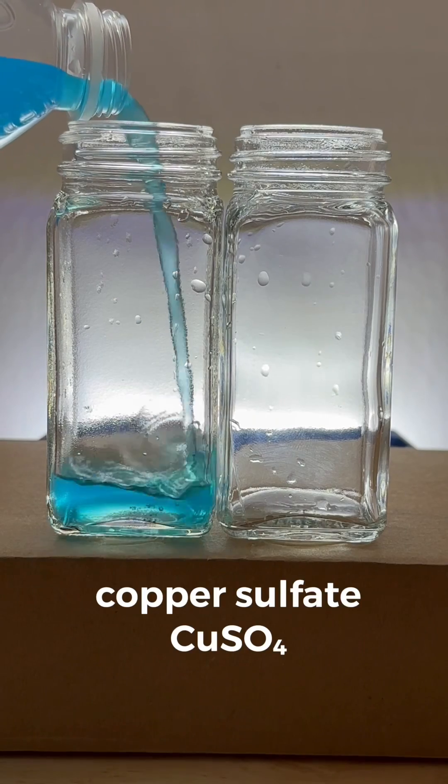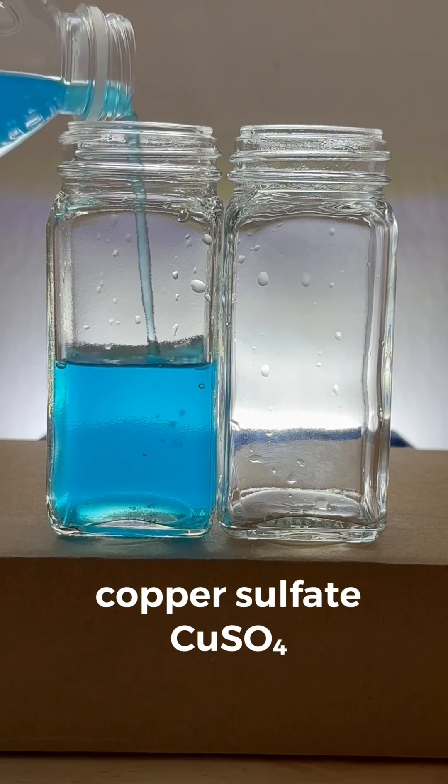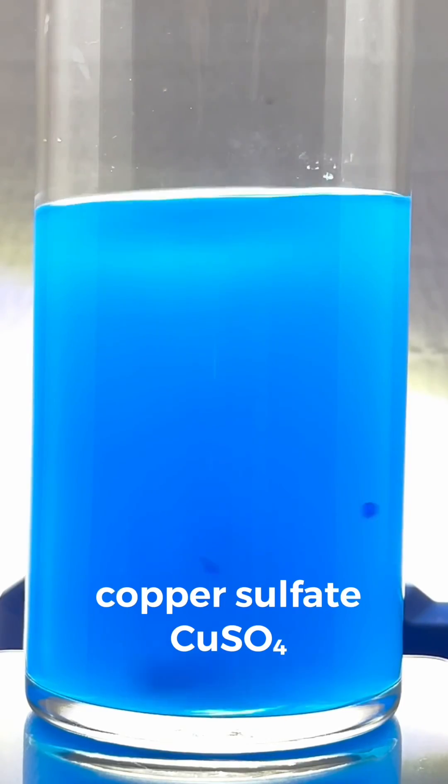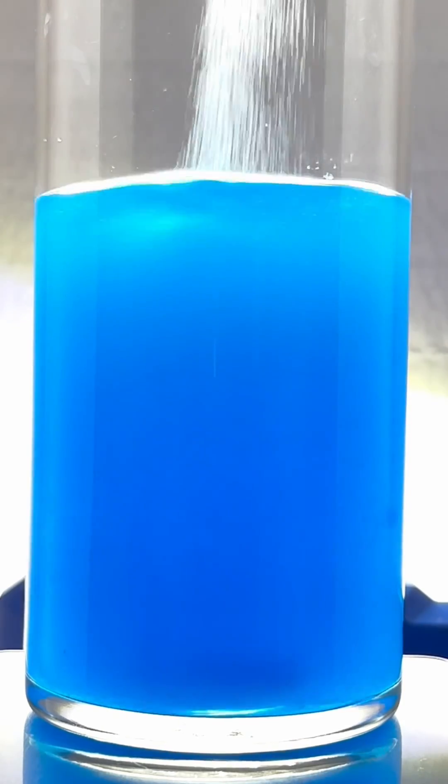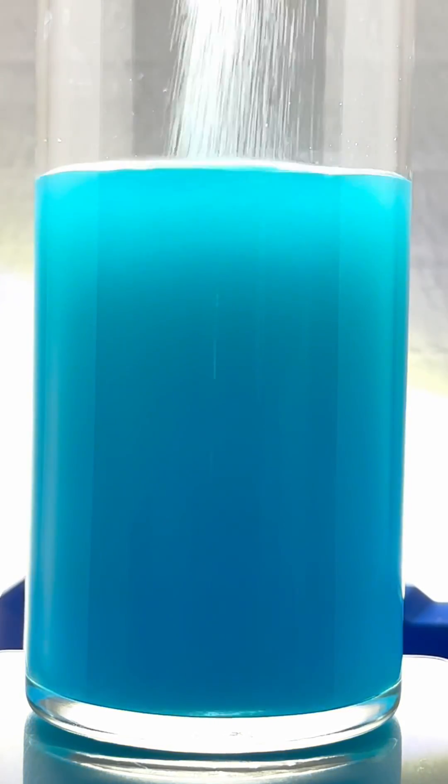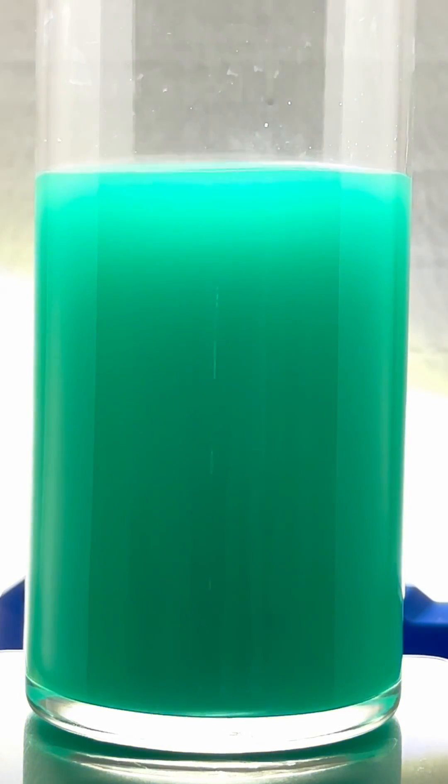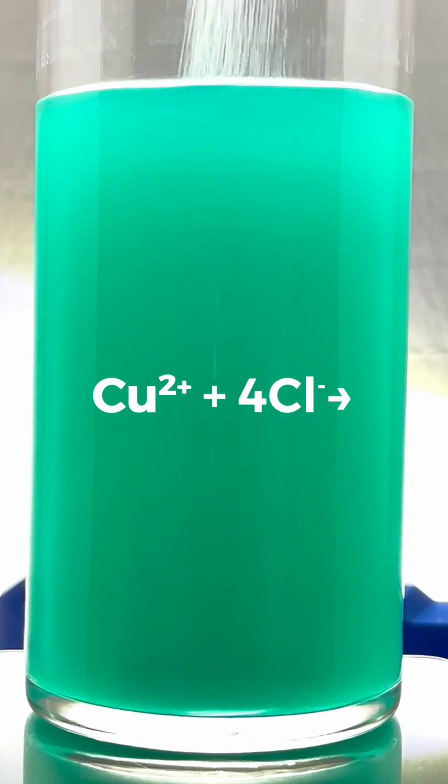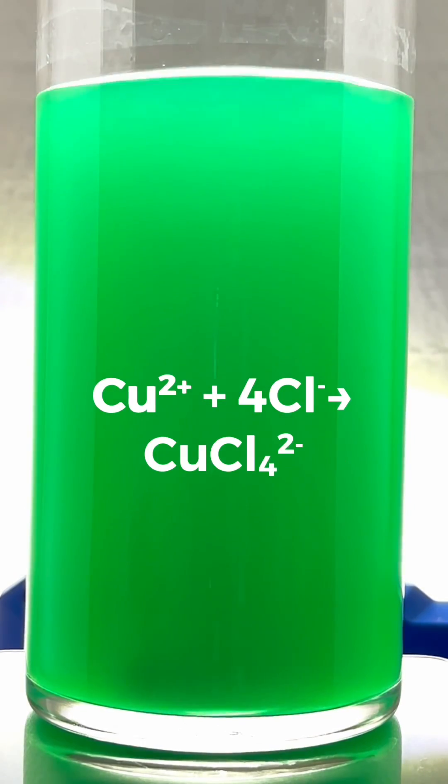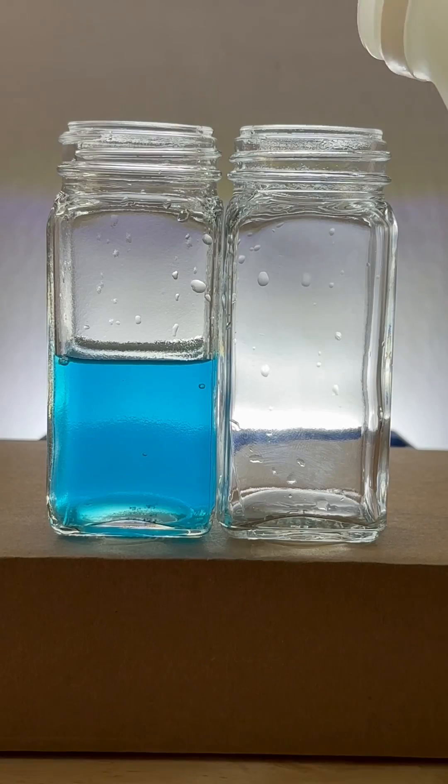Solutions of copper sulfate contain copper ions and have a beautiful blue color, but check out what happens when I add some salt to the solution of copper sulfate. The color shifts to green. This is because the copper ions react with the chloride ions in the salt to form a green colored copper chloro complex.